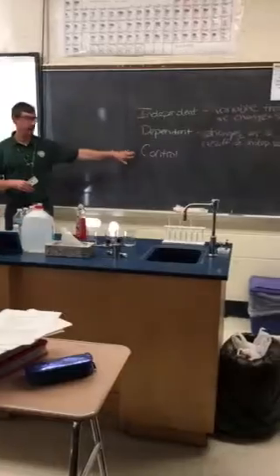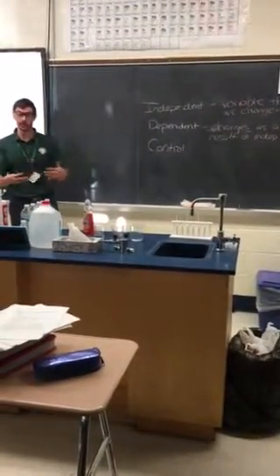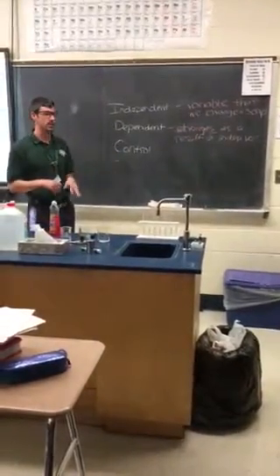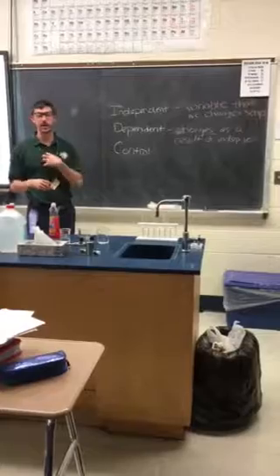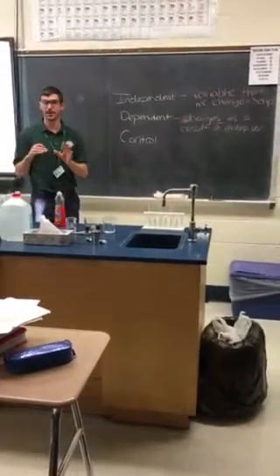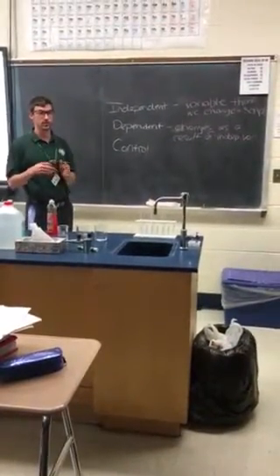Thank you, Javon. And then your control is a sample that you're comparing the other samples to. So in this case, it's going to be water that I have intentionally made hard by adding calcium ions into it using calcium chloride.